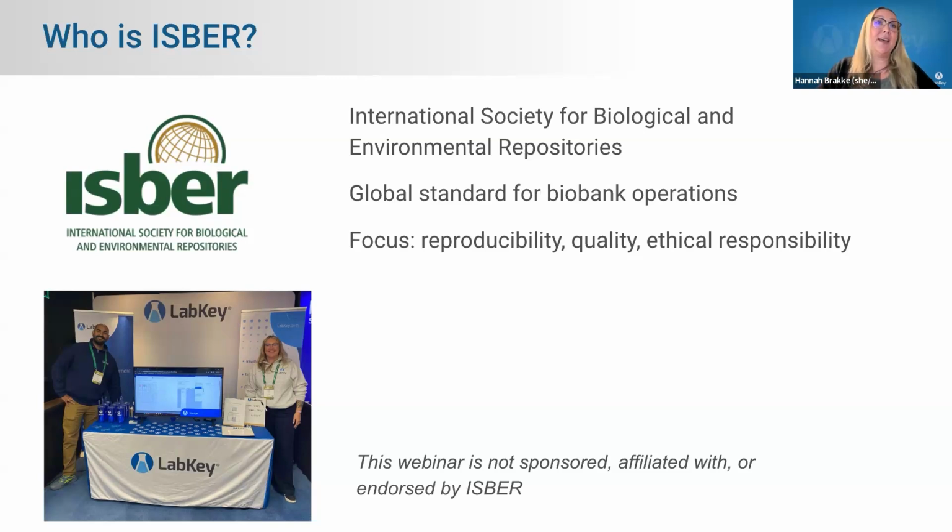If you joined the ISBER annual conference in Montreal in May, you'll probably recognize this picture of Varun and I at the booth that we had there.